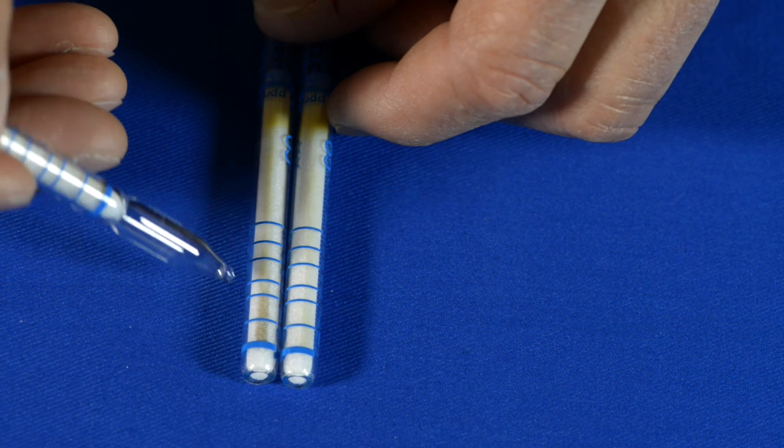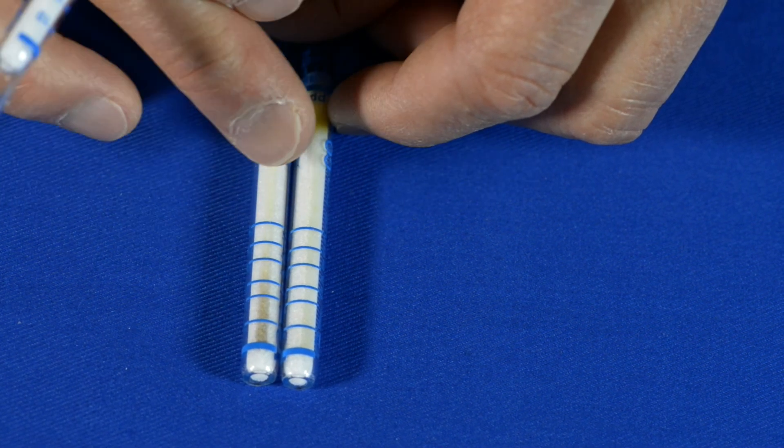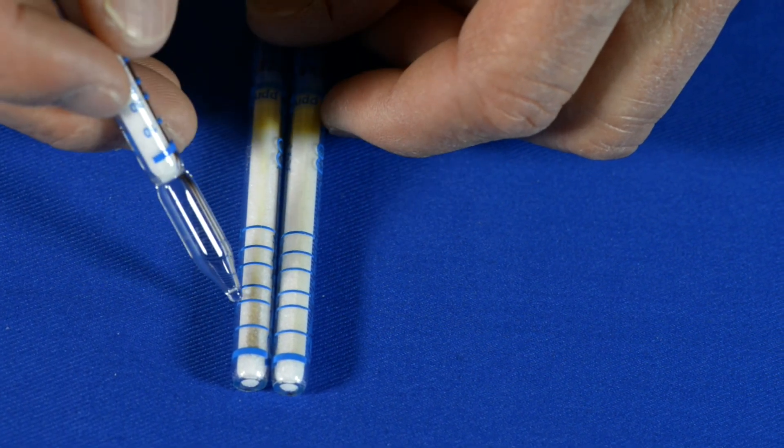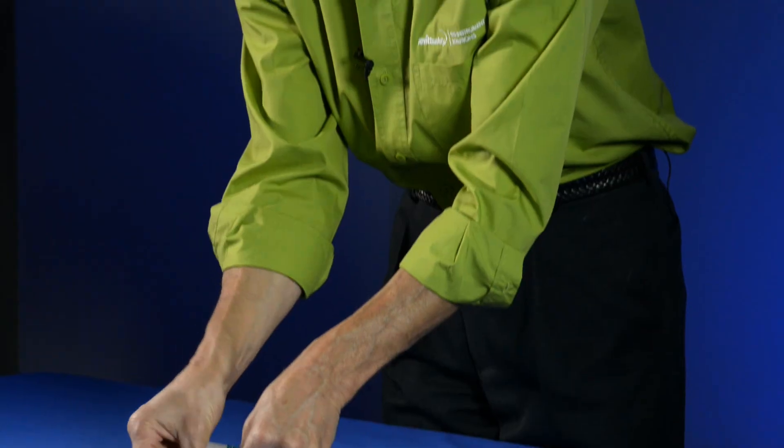It's starting to stain the area between the second and third line. So we're looking at at least 30 parts per million of carbon monoxide showing up on this tube.